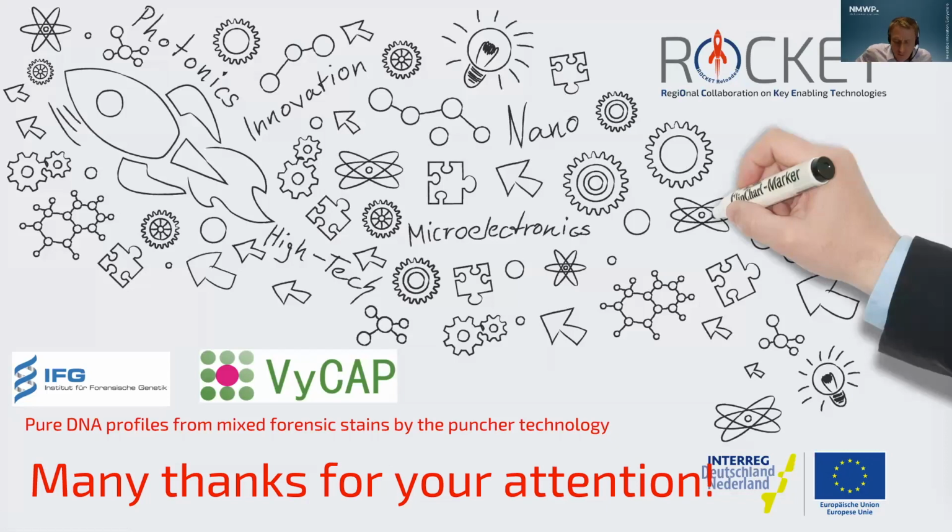Yeah, thank you very much for this interesting talk about the outcome of the project. I think you mentioned it already a bit, but I thought about now. I think the goal of the project was to identify single cells, but now you could think otherwise. What about automation to identify single cells, but 1,000 single cells at the same time? So my question would be, do you separate and identify the cells by hand, don't you?